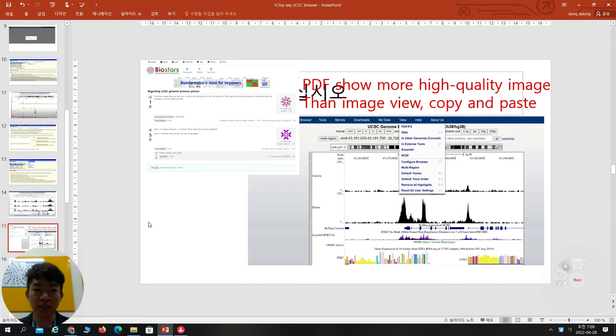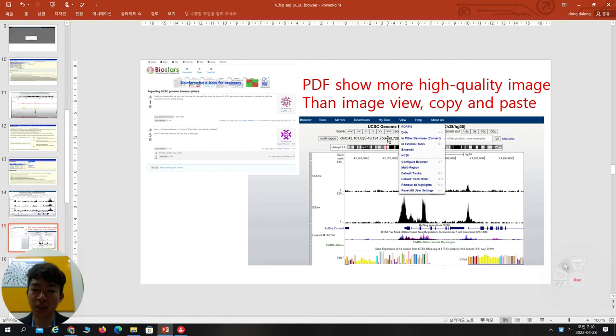After searching and rearranging, you can get the file display. You can make a PDF or capture an image. When I did this, PDF shows higher quality images than image view. So after viewing, click the PDF option. You can also try image view, but the image quality is less than PDF.